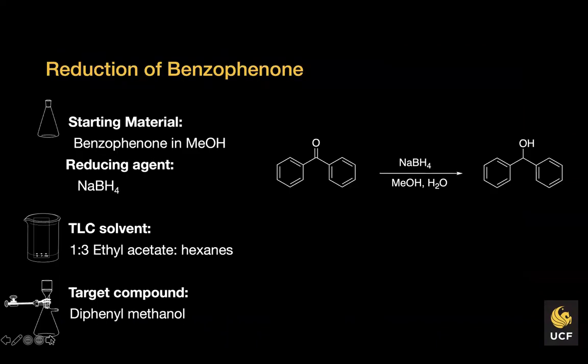All right. Well, this week's experiment really involved the reduction of benzophenone. The starting material, we had benzophenone and we dissolved that in methanol. We made sure we cooled the reaction mixture because once we add sodium borohydride, which is the reducing agent, the reaction is exothermic. So we wanted to make sure it's on ice.